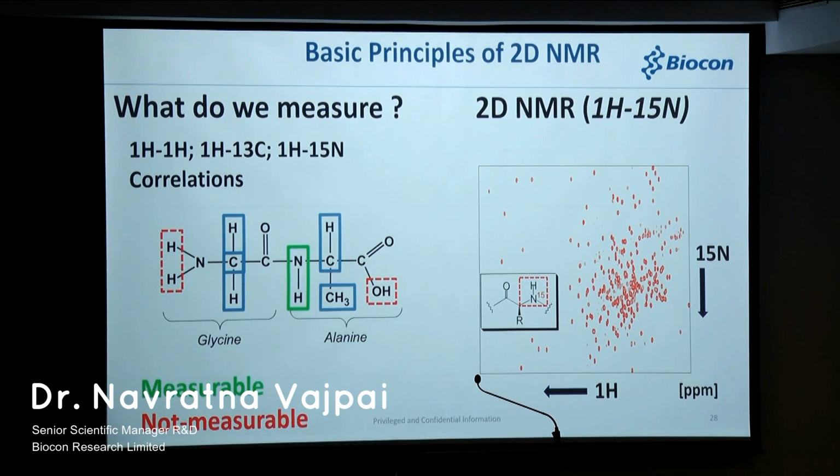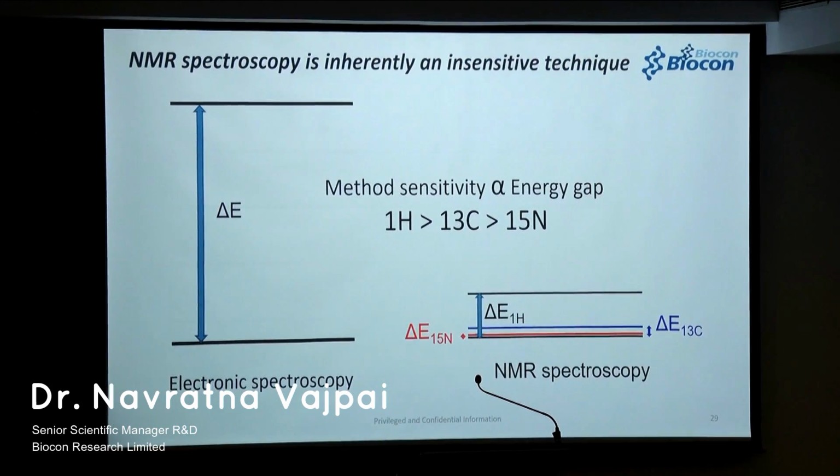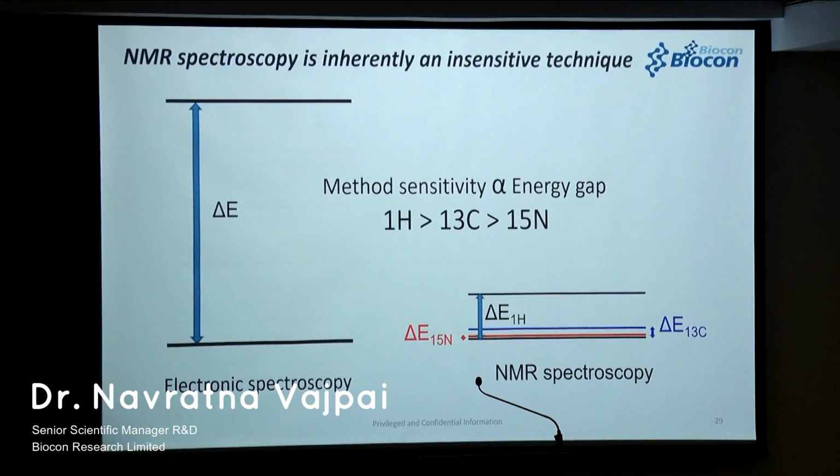And that is why if you see a difference in either of the amino acids, you will be able to notice that. And that is why you want to go towards a higher resolution technique so that you can get that information. Okay, so we go to the next slide. Now, he also mentioned that the technique as such is extremely insensitive. Still, it has got a lot of advantages.